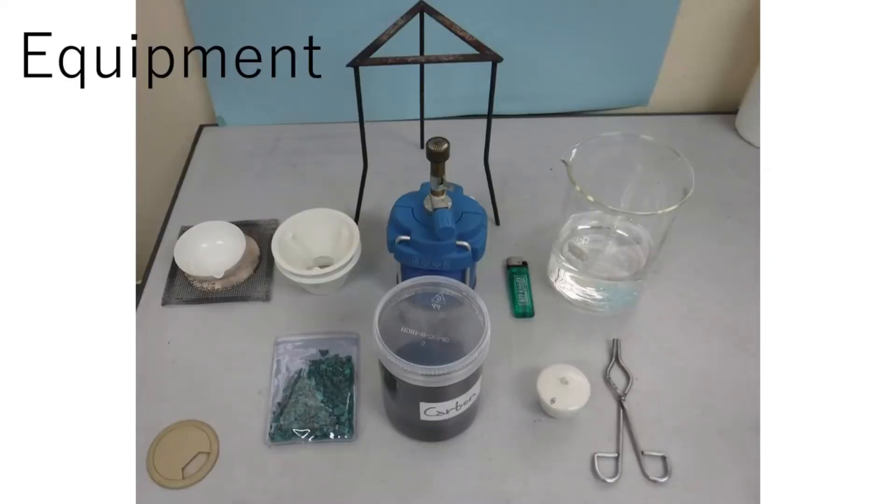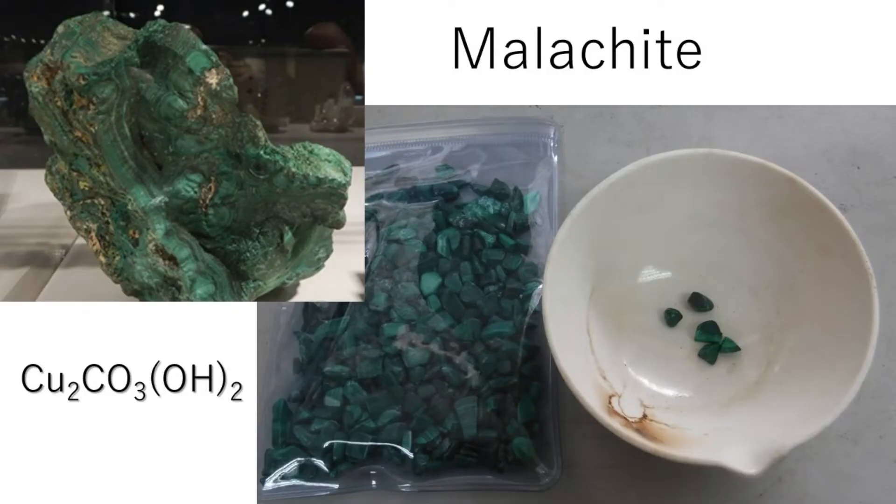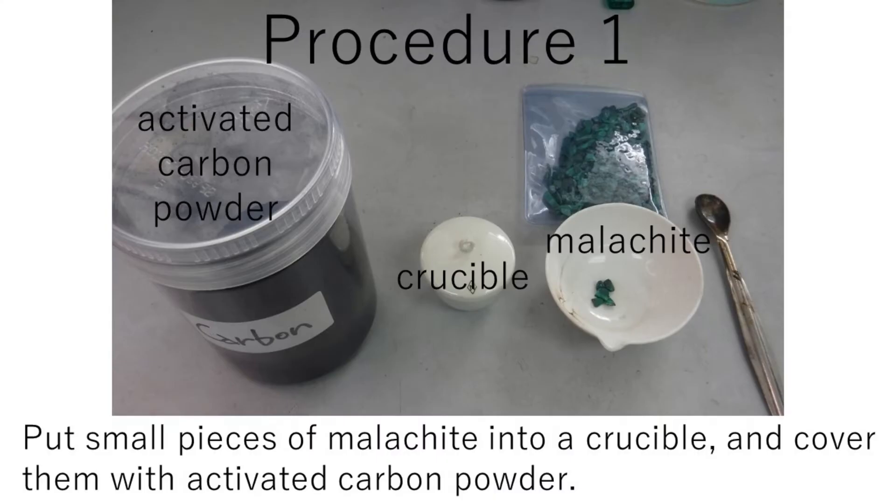Equipment and materials for the experiment. Malachite is a green copper ore. Procedure 1: Put small pieces of malachite into a crucible and cover them with activated carbon powder.